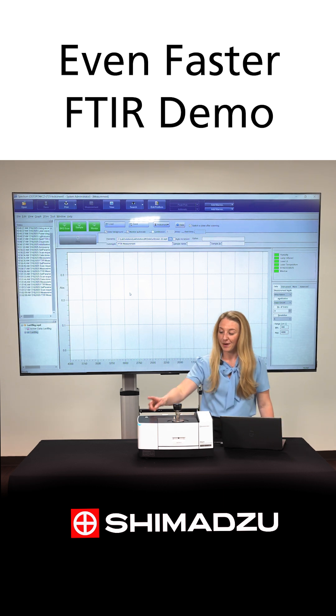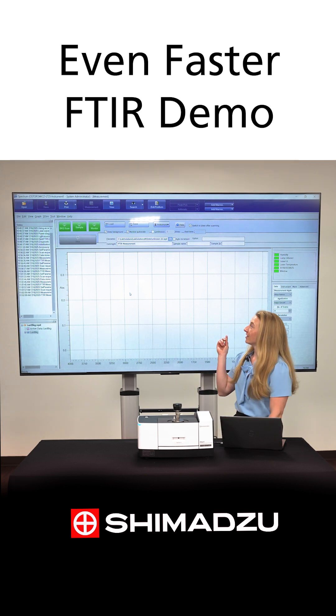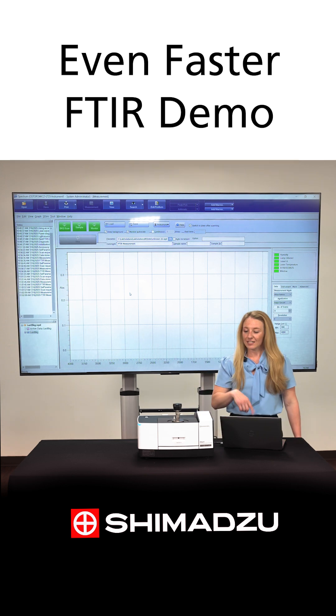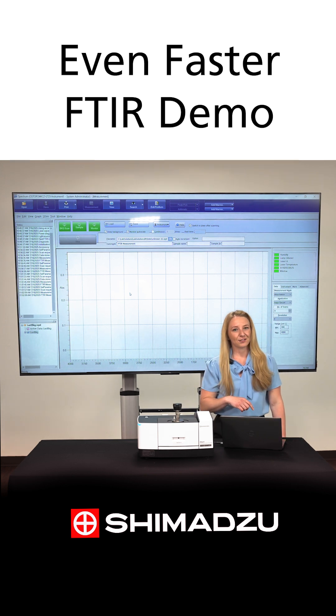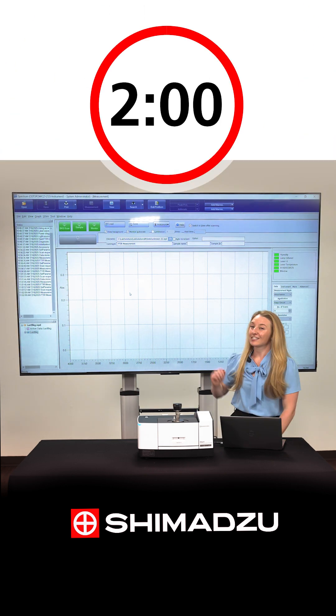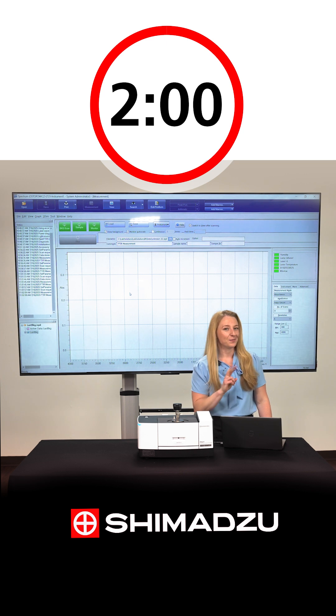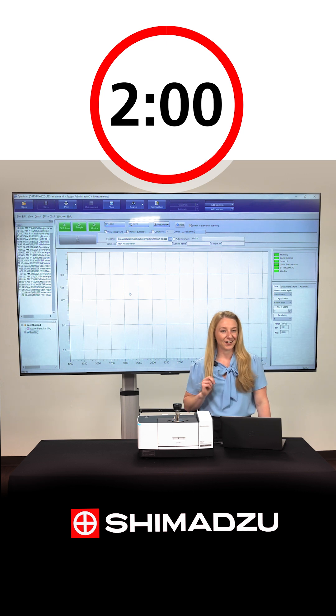I already have it powered on, initialized, and connected to the software, so we are ready to run. I have our stopwatch to see if we can actually do it in under two minutes. Let's find out.